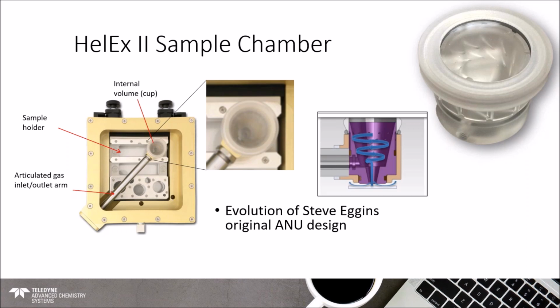It's within that drawer that the samples are actually placed, either through 1-inch round pucks, where you would take a sample and place it in an epoxy before analyzing. It also has 1/2-inch rounds, which are often used for standards, and it has a place for 4 thin section or petrographic slides, more often than not used for biological samples and the like.